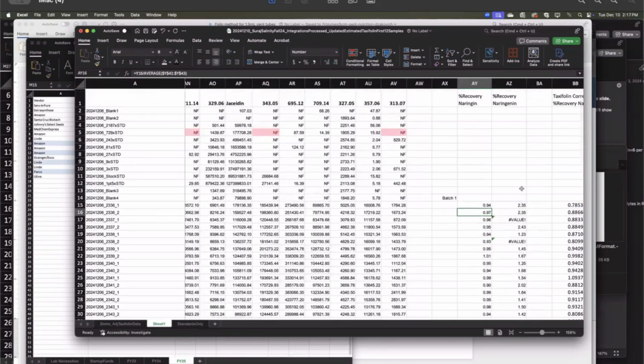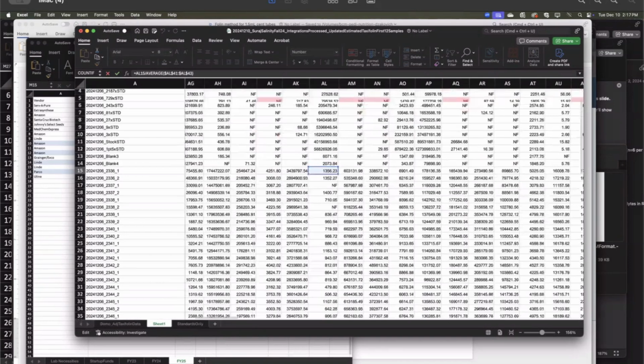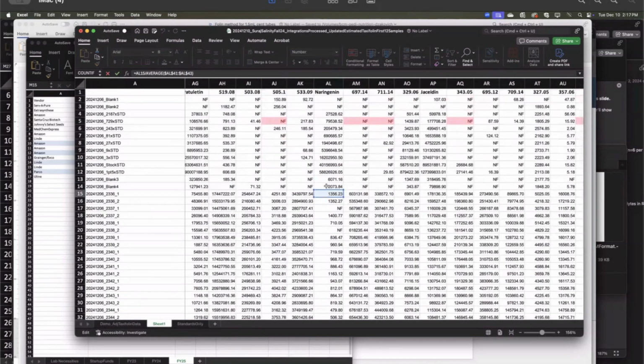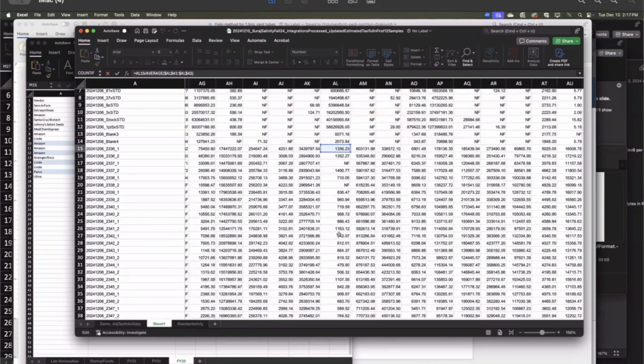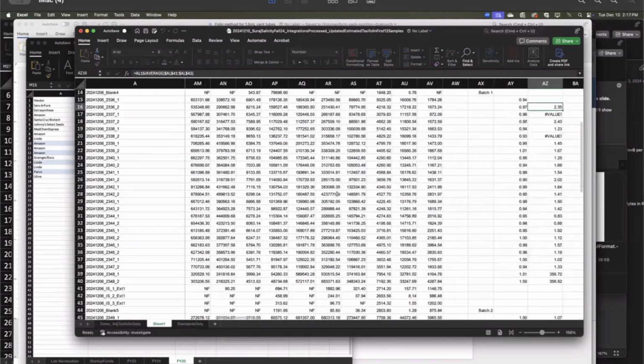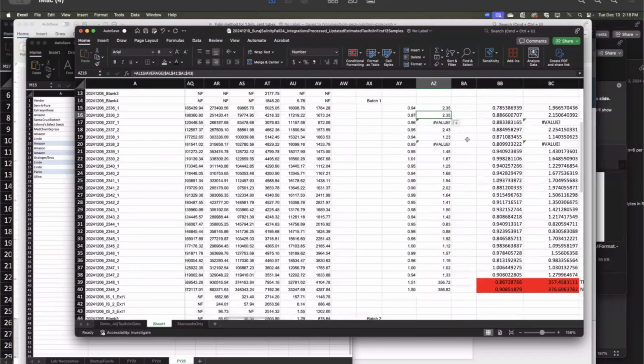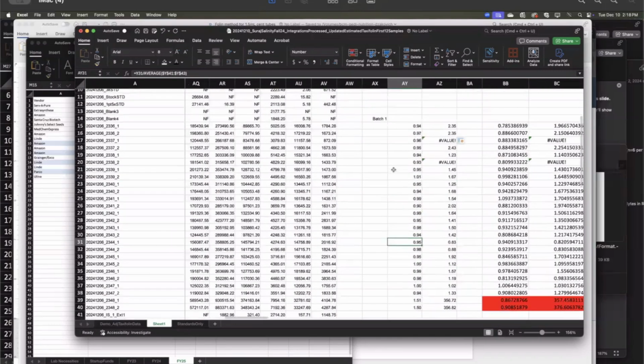In this case, these numbers are a little bit goofy because in that first batch, looking at my notes here, it looks like only naringin was used and not naringenin. So it's basically bogus numbers, just trace peaks that the instrument was picking up. We can ignore that for now. Regardless, we basically have our extraction recovery here. But the thing is that this doesn't necessarily hold true on a mass spectrometer.